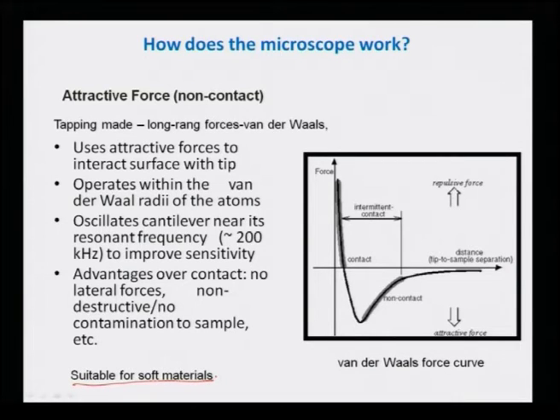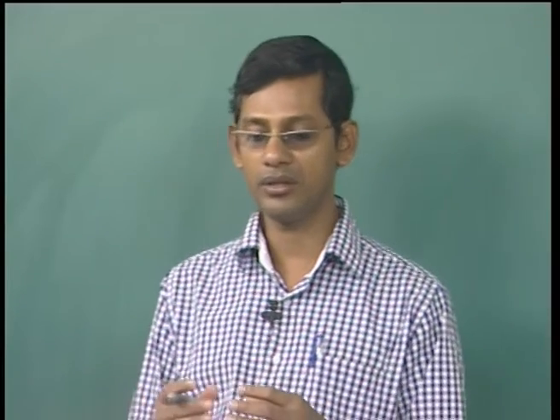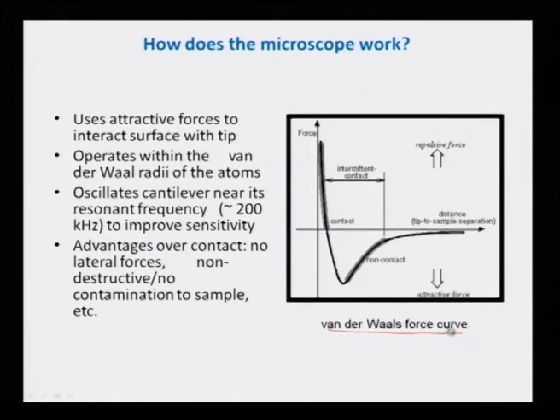And the other mode, which is contact mode, is basically suitable for hard materials, because even if the tip hits the sample surface, there will be no deformation activities on the sample surface, which will not change the material surface or the chemistry of the surface because of contamination or the change of atoms on the sample surface. So, the attractive force, as I just said, depends on the van der Waals forces. So, the distance should be maintained such that the van der Waals force radius of the atoms becomes comparable with the tip distance.